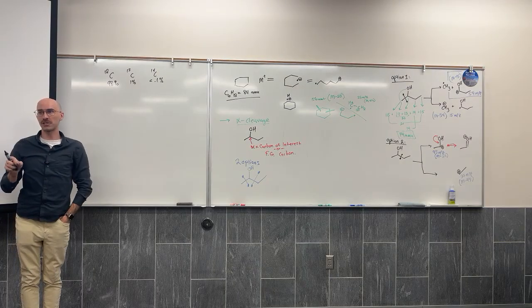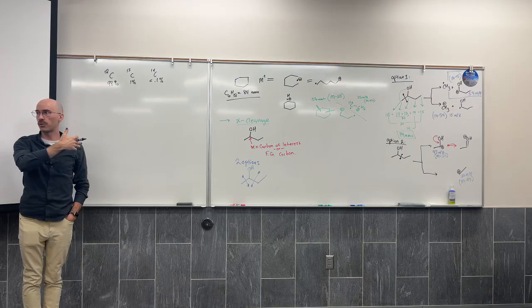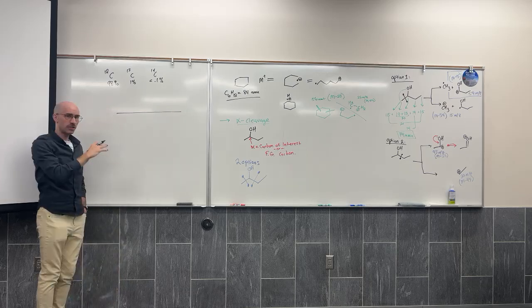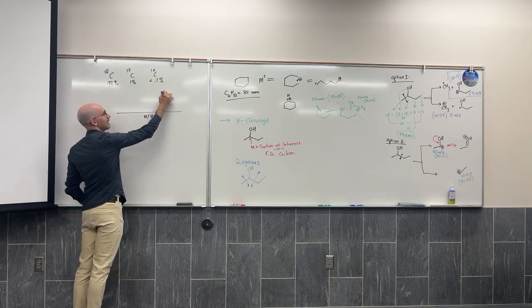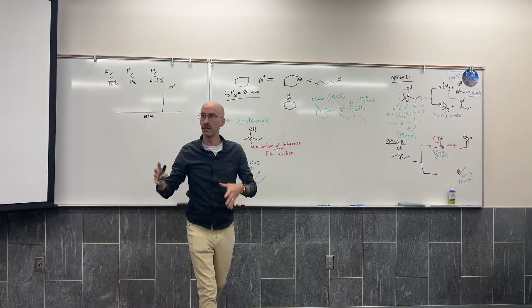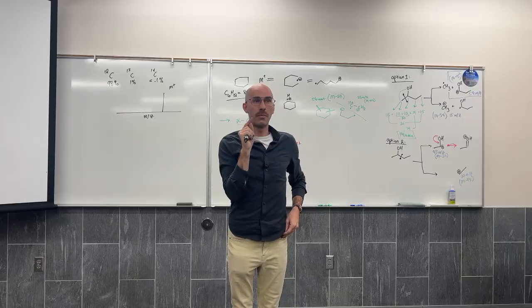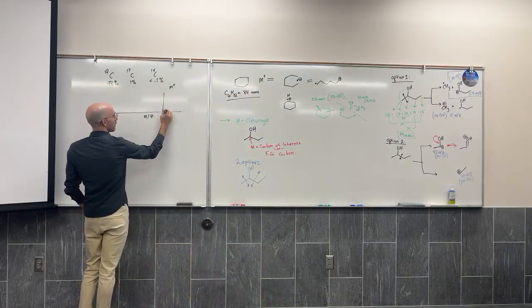But 98% of all of the carbons in your structure are carbon 12. What that means is you get a mass spectrum where 98% of the carbons forming the molecular ion signal are carbon 12, but 1% are just a little bit heavier.